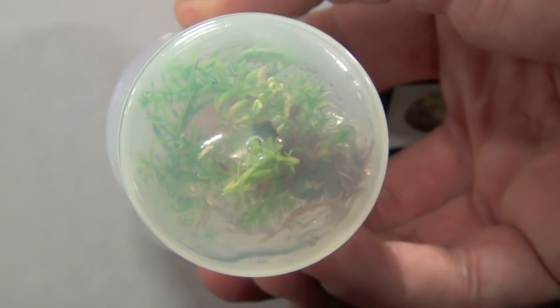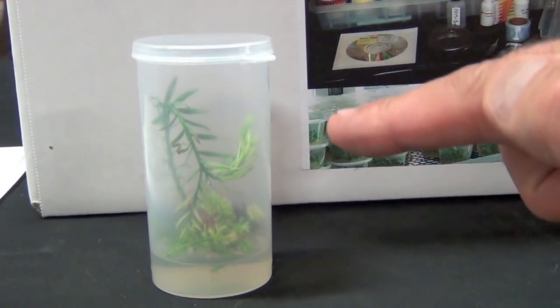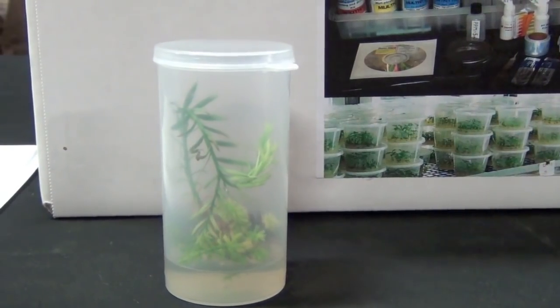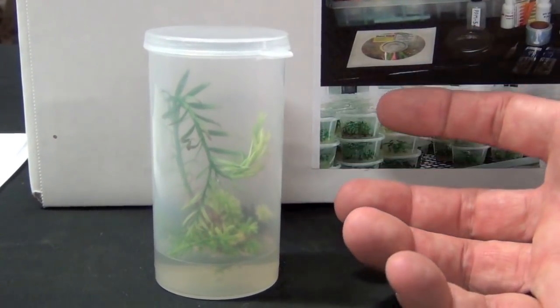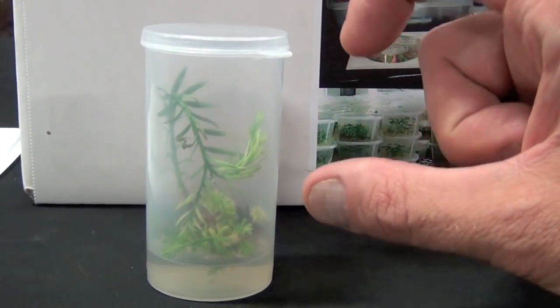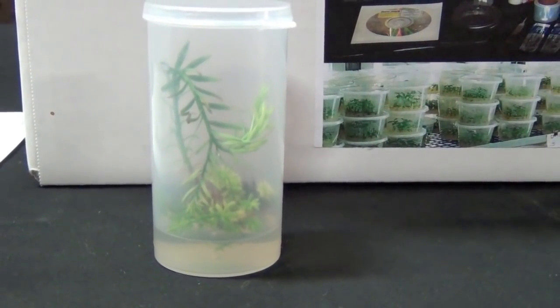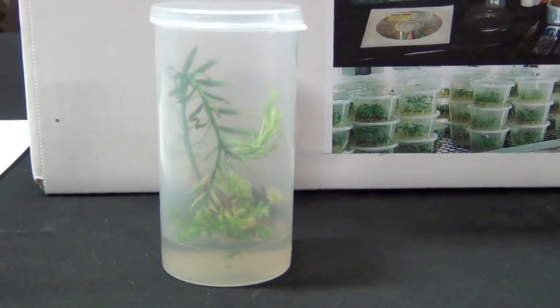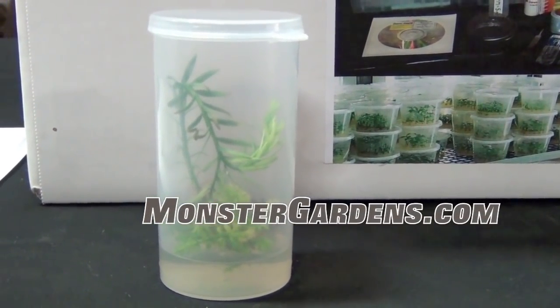Every one of these can be divided, planted into new bottles, and give us all of this over again. Because we're not trying to create more bottles than we can handle — we're trying to create new plants. I'll just do enough of these so that pieces can be taken from tissue culture and planted into regular propagation trays, and the pieces I put back into tissue culture, just moved to a fresh bottle, will give me all of this over again. If I know that this bottle can give me twelve new plants, I only need one piece to get twelve all over again. It's about six weeks old, but if I'm doing fifty of these, that's going to give me about five hundred new plants every six weeks — and I'll still have the mother material next month.